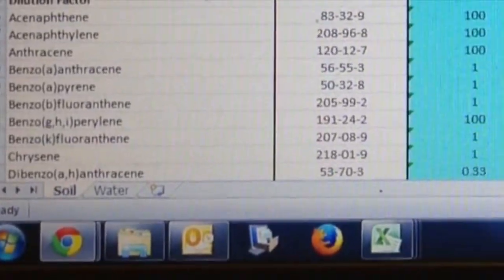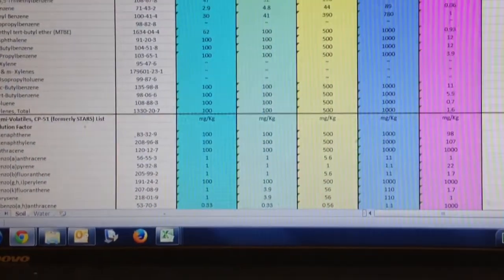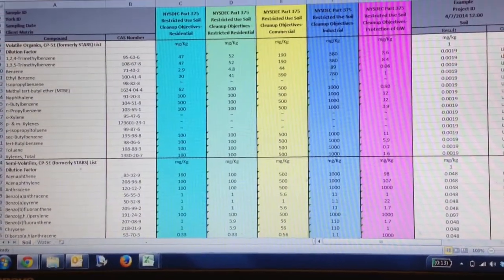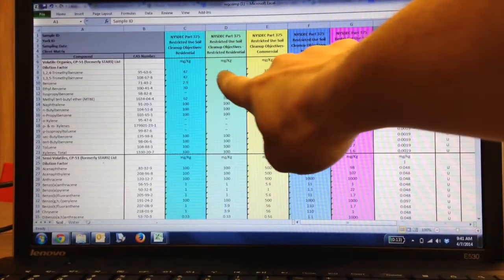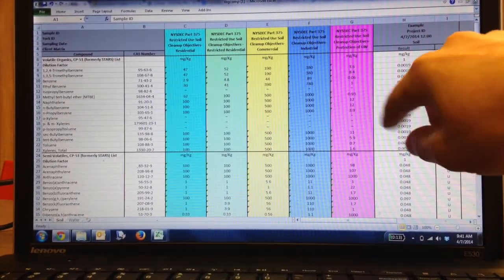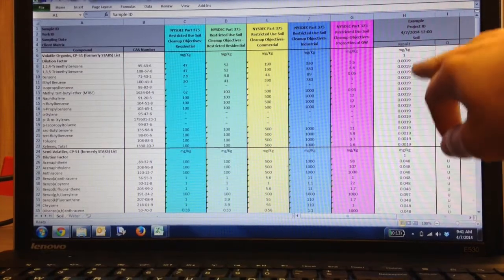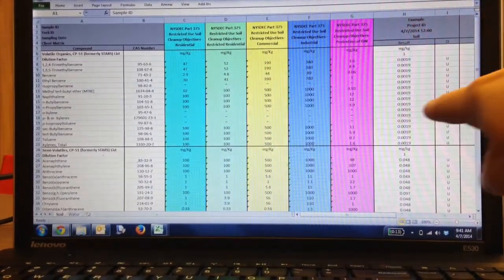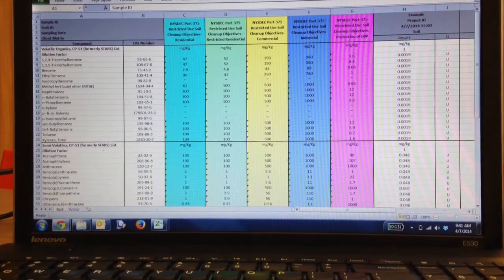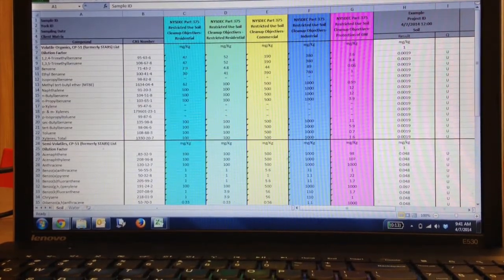The Soil tab and the Water tab are accessible down here at the bottom — you've got Soil and Water. This is your Excel sheet that downloaded from the EDD Creator. As you choose different Regs, they're highlighted in different colors, and any exceedances would be highlighted on your sample according to the color it corresponds to. It's important to keep in mind that if it highlights in one color, it may also exceed another Reg.